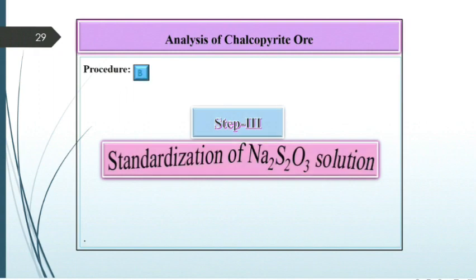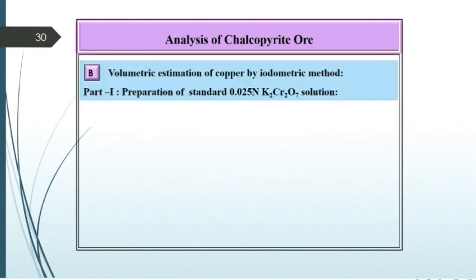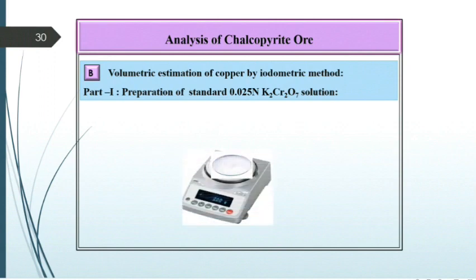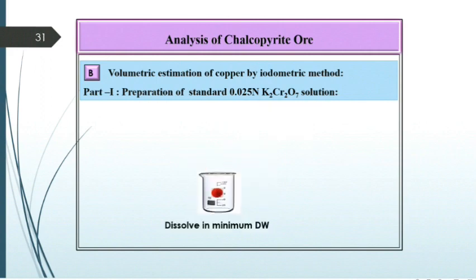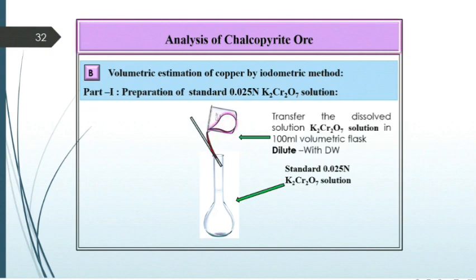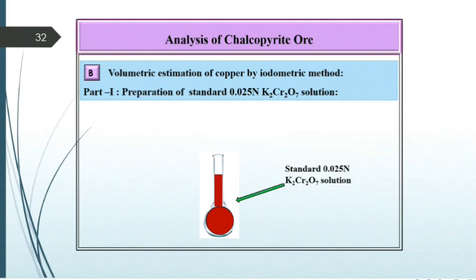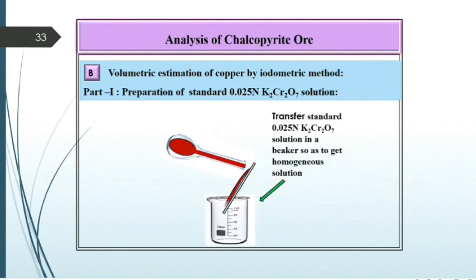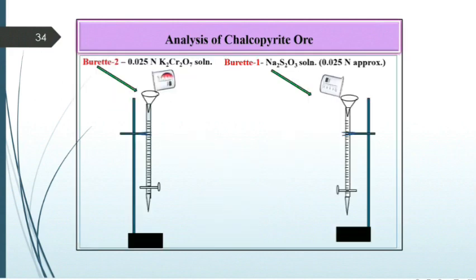Step 3 is the standardization of Na2S2O3 solution for the volumetric estimation of copper by the iodometric method. First, prepare a standard solution of 0.025 normal K2Cr2O7: weigh 0.1225 gram of K2Cr2O7 on a watch glass, transfer it into a beaker, and dissolve it in a minimum amount of water. Transfer this solution into a 100 ml volumetric flask and dilute it up to the mark using distilled water. Transfer this solution back into the beaker to get a homogeneous solution. Fill burette No. 2 with this 0.025 normal K2Cr2O7 solution and burette No. 1 with Na2S2O3 solution.